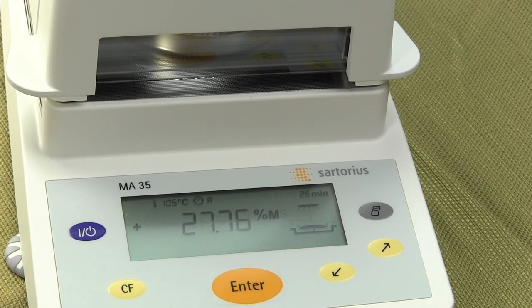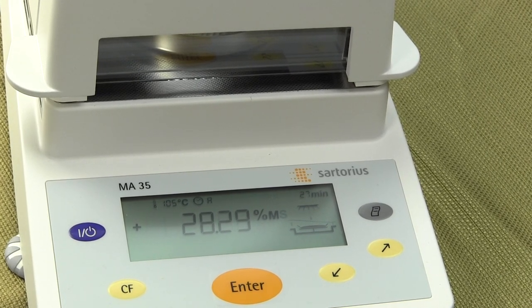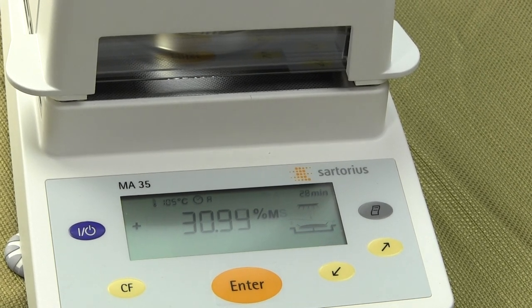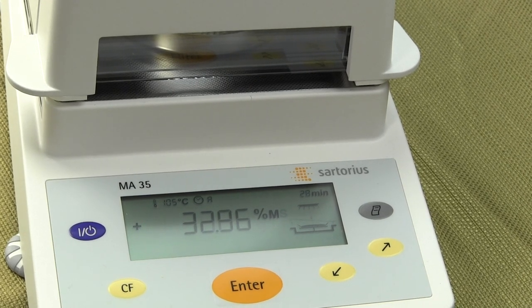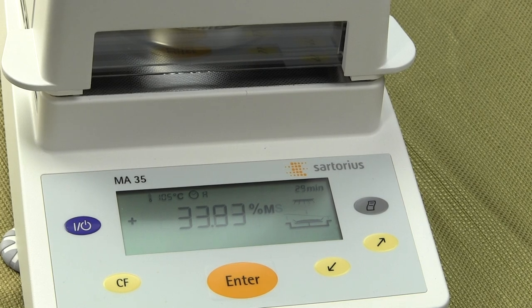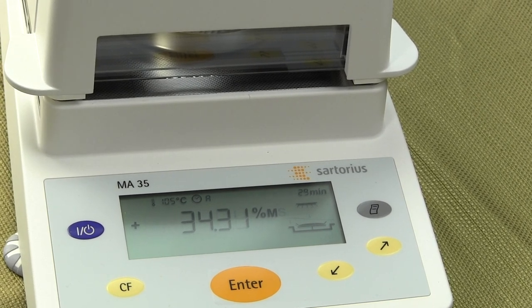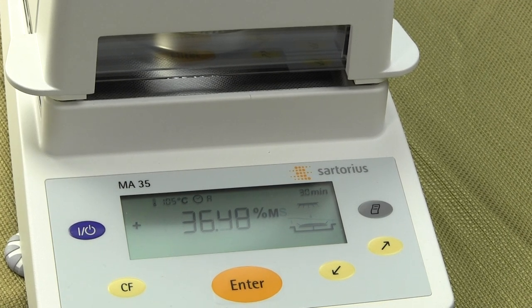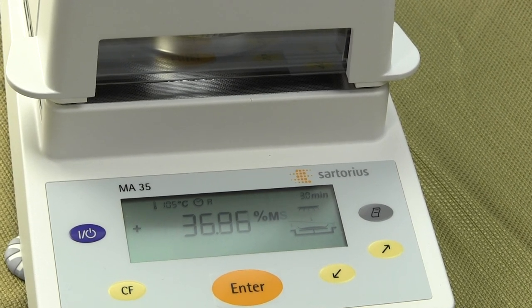The setup of the moisture balance in auto mode is simple, but you can also go into manual and set whatever parameters you want — anywhere from 40°C to 160°C. Time-wise, you can set the time from 0.1 minute all the way up to 99 minutes. Most people run this unit in auto mode because it's so simple to use.